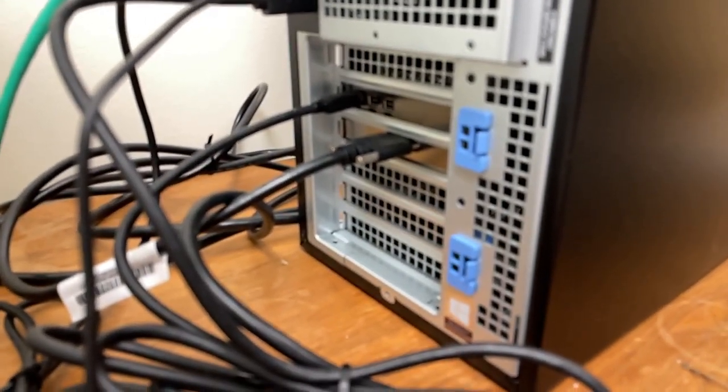No, it's not that it's old because it has FireWire. It has an expansion PCI card in there for FireWire because a lot of the imaging cameras just run off FireWire interfaces because they provide, I guess, enough power and bandwidth, and everything in science is really slow. So I guess they haven't switched over to USB 3 yet.